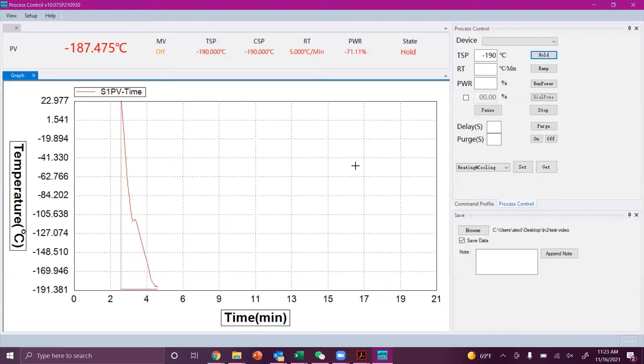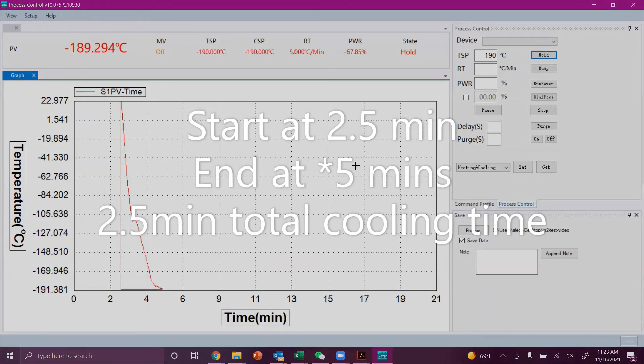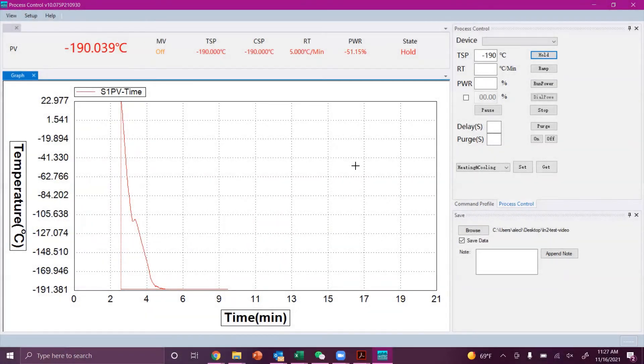In this instance, we used the hold command starting at about 2.5 minutes and we reached our target temperature at the 4 minute mark, so just a total of 1.5 minutes cooling time. You'll then notice the temperature is maintained at the set temperature very closely. The LN2 pump will be given commands by the controller to turn on and off as needed to keep the temperature stable.